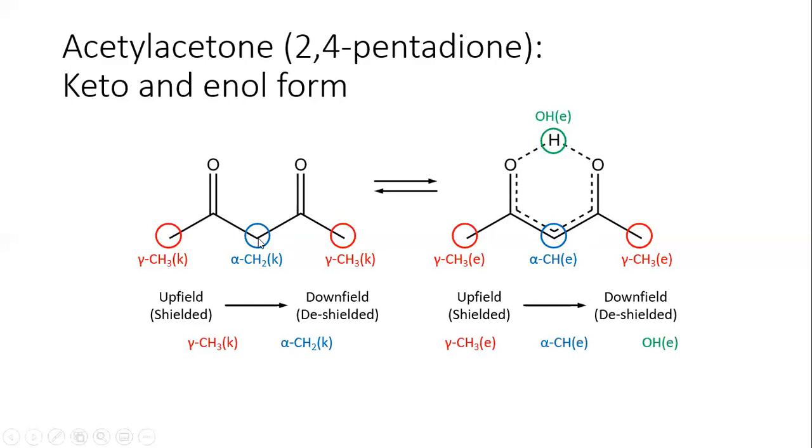Okay. And we will analyze that in more detail once we go to the spectrum. But now we can already see that there is a pattern between the protons in their form, but there is also a pattern between groups of different forms, and we will use that in order to be able to fully interpret the NMR spectrum. Okay.